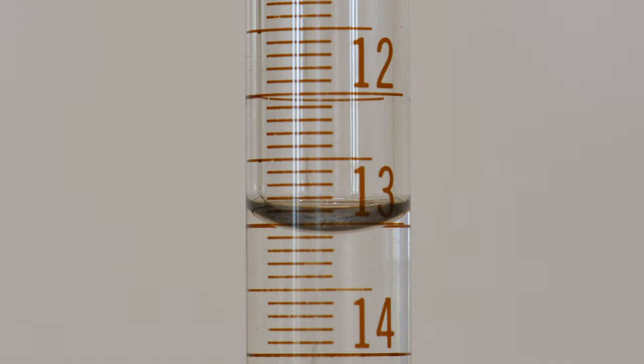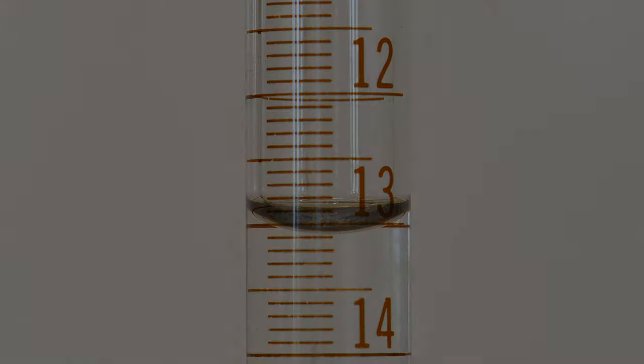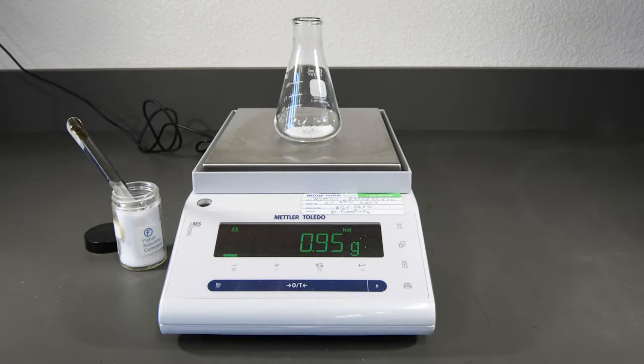Here's the burette reading from our first titration of KHP and sodium hydroxide. Keep in mind that the burette reads from top to bottom, so this is between 13 and 14 milliliters. This is the mass of KHP for our second trial.